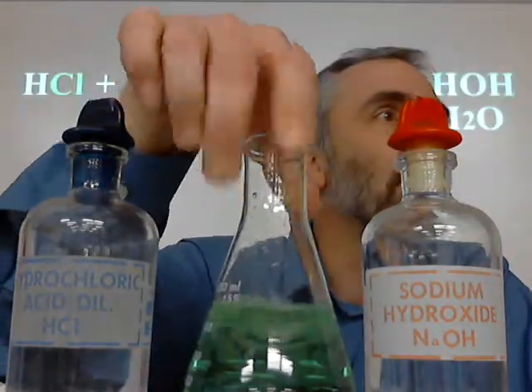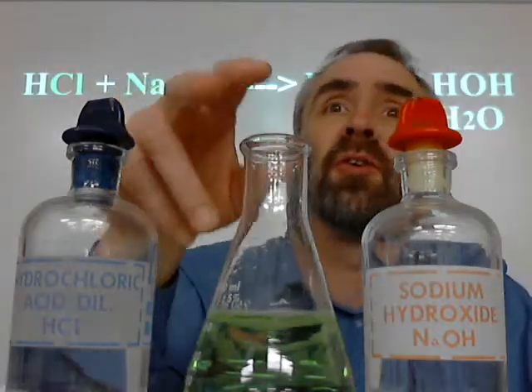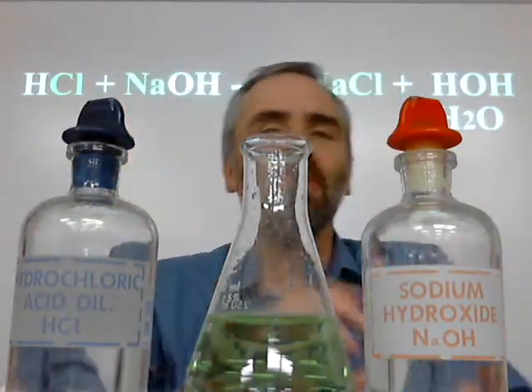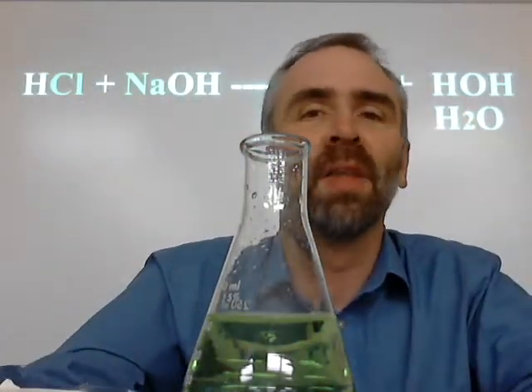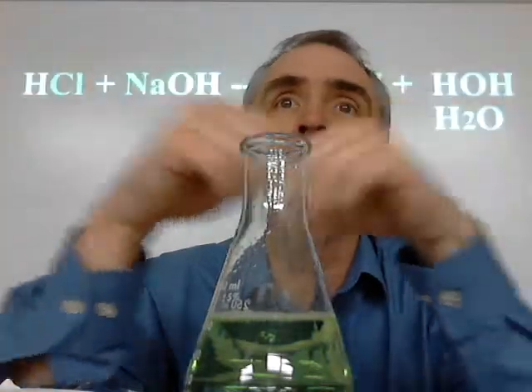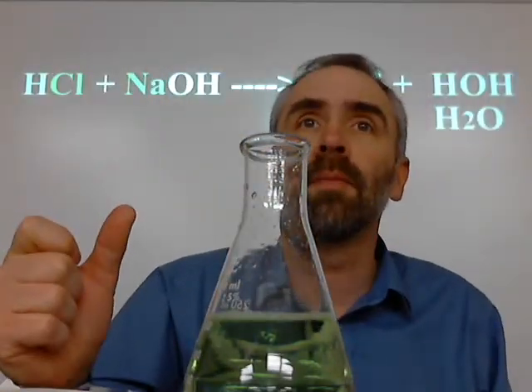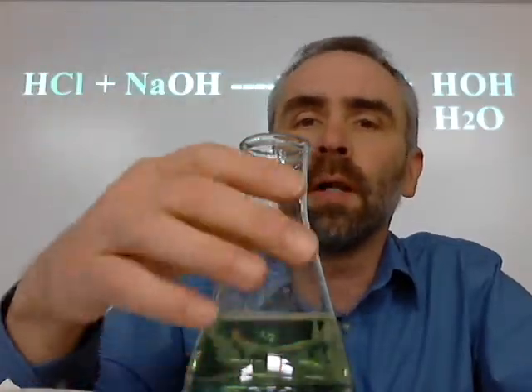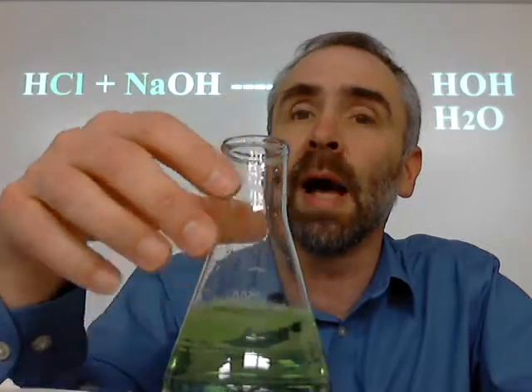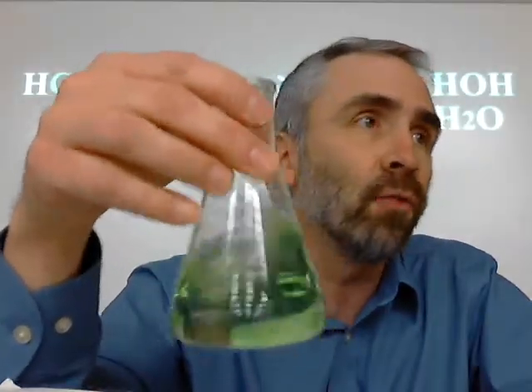By the way, if you're wondering why it's doing that, let me explain. If you're like freaked out, Zach's like freaking out over there. The reason it's changing color is there are little drops of this stuck on the side. And this illustrates a great point. When we are doing our titration, you know the squirt bottles we have? We're going to be doing them in these Erlenmeyer flasks, because notice what I could do to an Erlenmeyer flask without spilling.